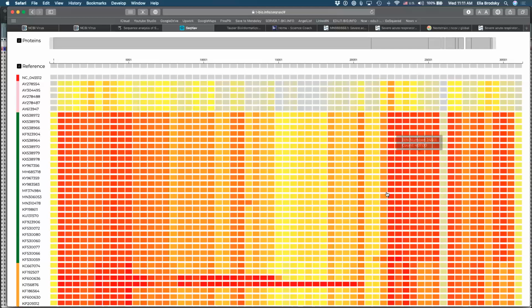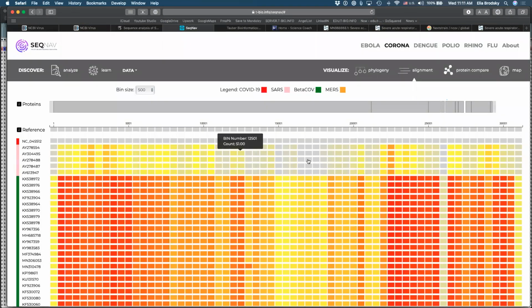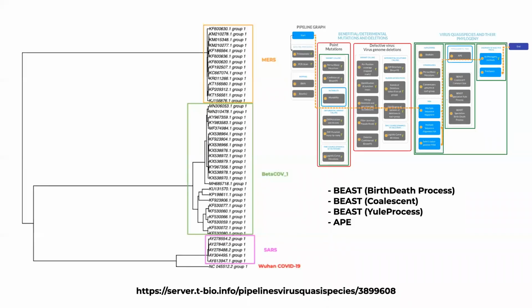And by looking at this overview, you can really see the significance of change in more general terms between what we have in general, right? The distance between these different viral genomes. So this is where I think we can go further in our future sessions. And the next session that we plan to organize is going to be related to the different proteins that we plan to analyze to better understand how the virus enters the cell, how it replicates, and what would be the different outputs from these different algorithms that help us analyze this data.